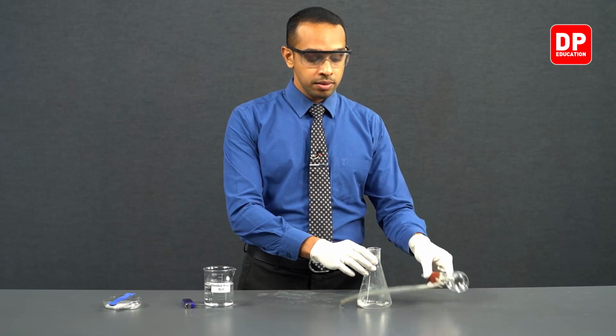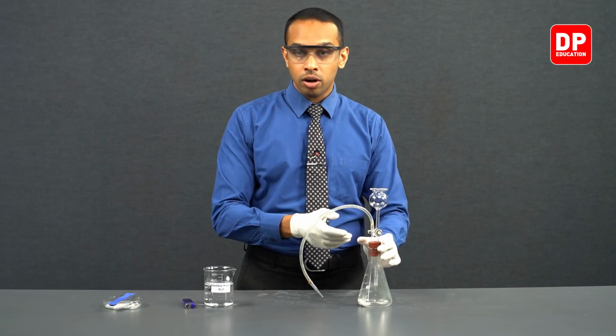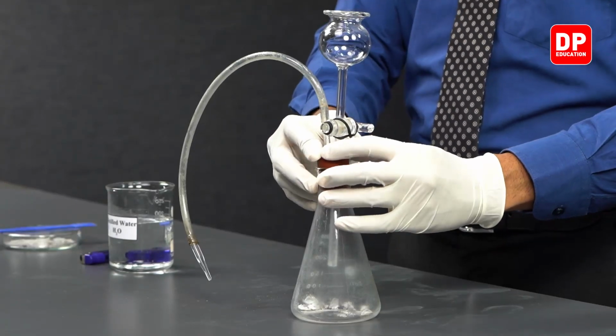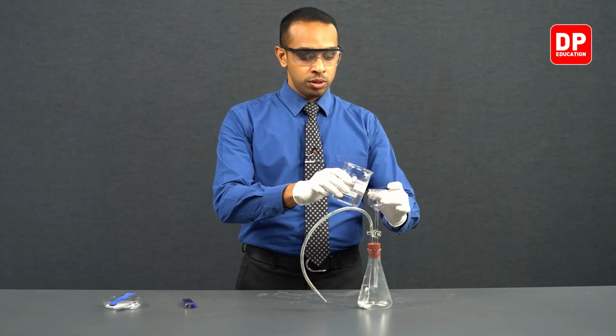And then we will place the stopper and make sure the valve on our thistle funnel is closed. After that, we can proceed to adding some water into the thistle funnel.